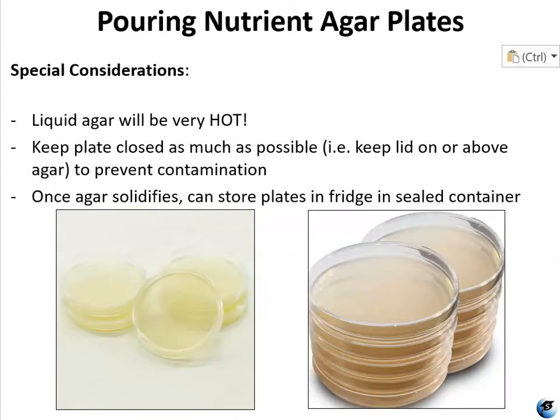Some things to be very mindful of: when the agar is liquefied it's going to be very hot. You're going to want to keep your plates closed as much as possible — keep the lids on them, and keep the lids above them when you're working inside the plate, in order to protect the agar from airborne contaminants. This goes for when you're pouring the plates, inoculating the plates, and observing the plates. Once poured and solidified, you can store them in the refrigerator — even near food if they haven't been inoculated yet, meaning they're still sterile — but keep them sealed in a Ziploc bag or some kind of sealable plastic container.